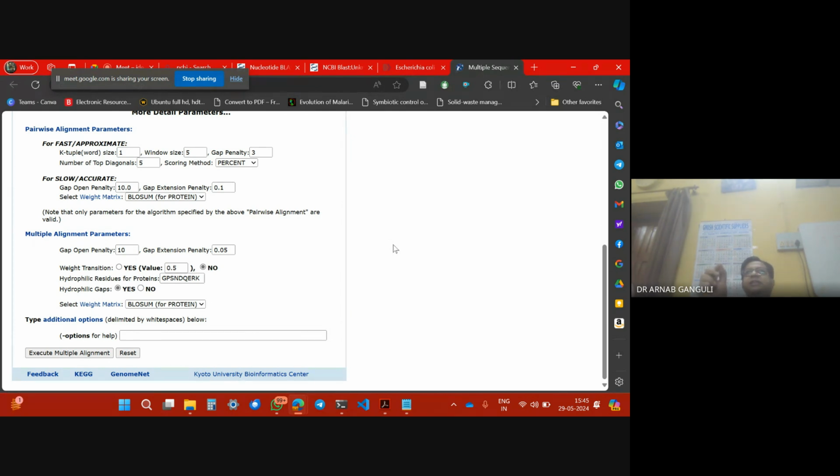So suppose this E value क्या दिया? 10 to the power minus 53. उस समय और भी क्लोज सीक्वेंस आ गया, 10 to the power minus 58 चला गया. What will you do? So you cannot reproduce it exactly. Maybe you will get the right. तुमको देख के हाँ सही है, but you cannot print it, publish it.